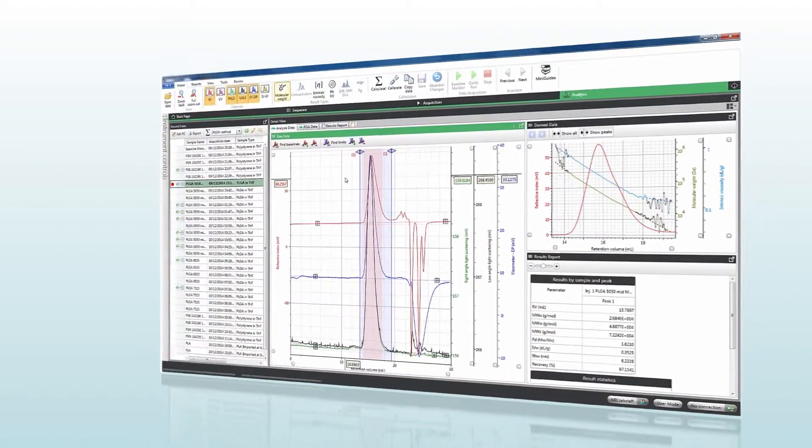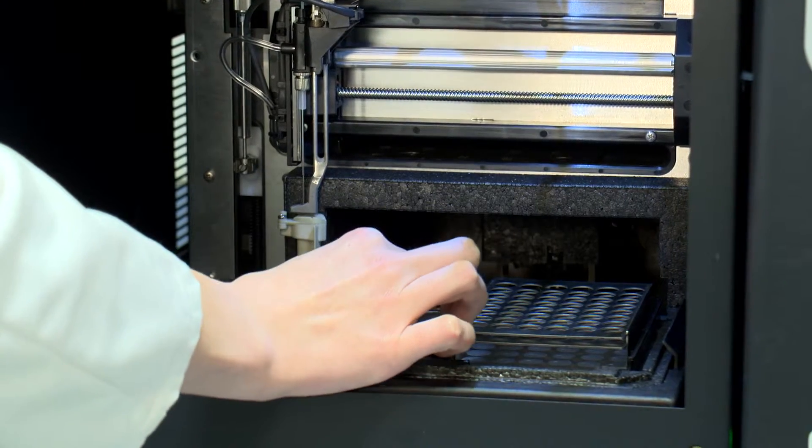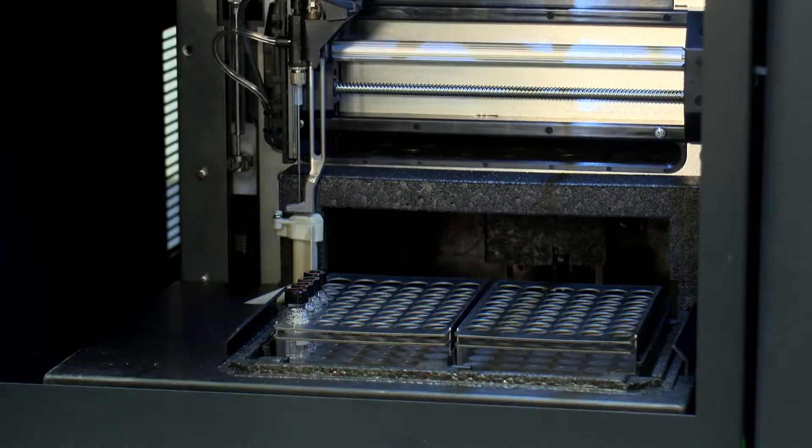We developed Omnisec keeping in mind two key requests from our customers. The first is that they want better data and better results, while the second is the desire for multi-detector SEC systems to be made easier to use.